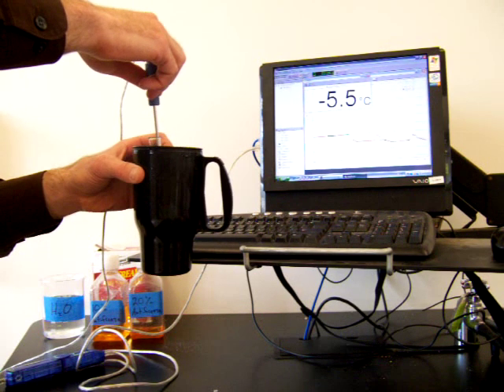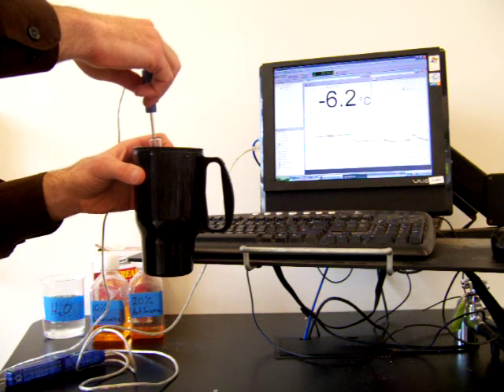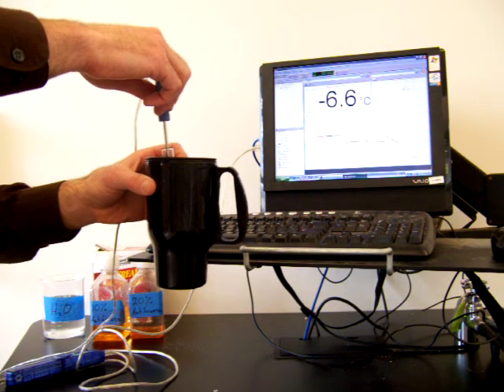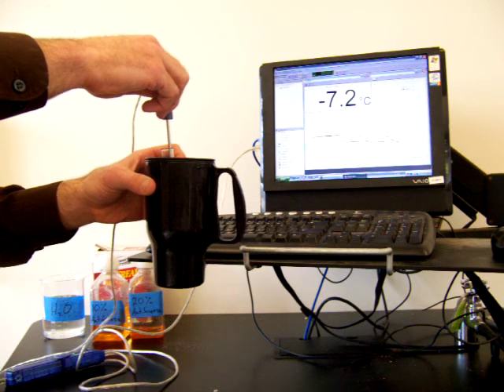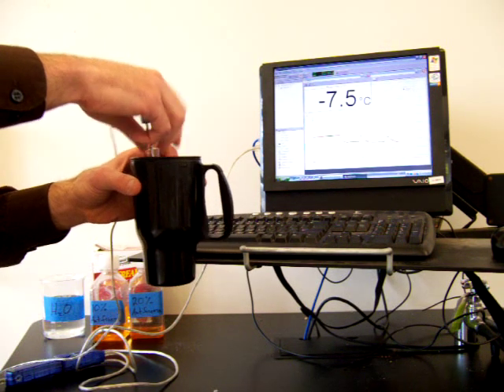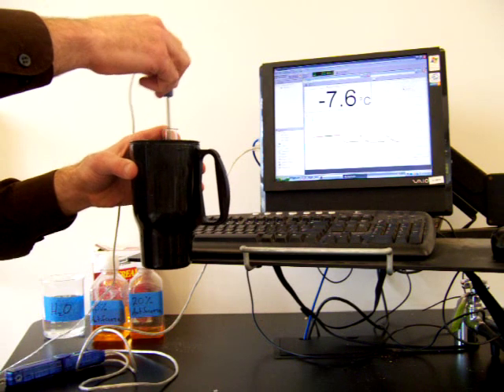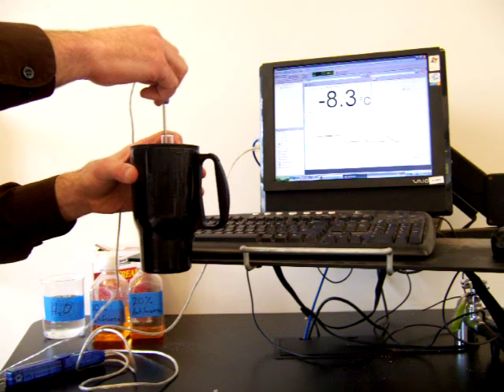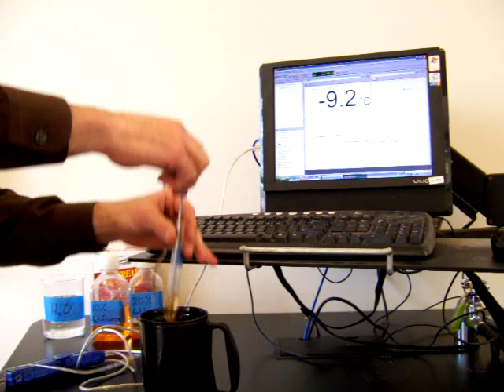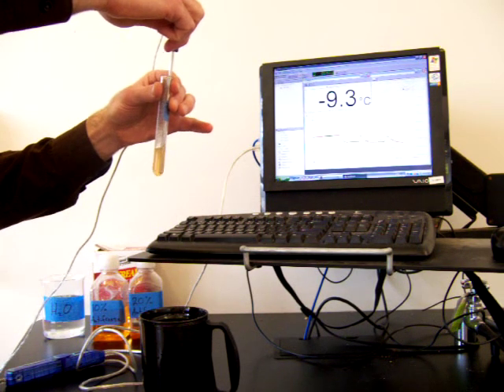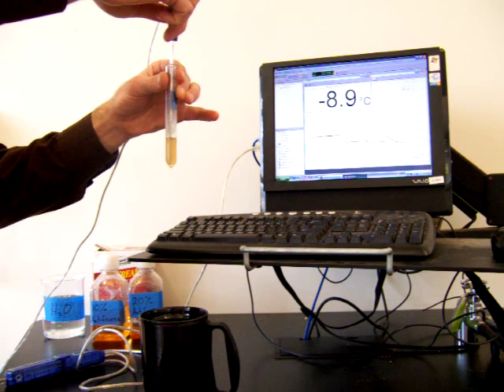So this one's probably going to freeze at a temperature lower than our 10% antifreeze solution. Remember, that one froze at negative 4.2 degrees Celsius. Just mix it around here in our ice bath. Let me peek in and see if any ice crystals are forming yet. We see ice crystals are forming right here.